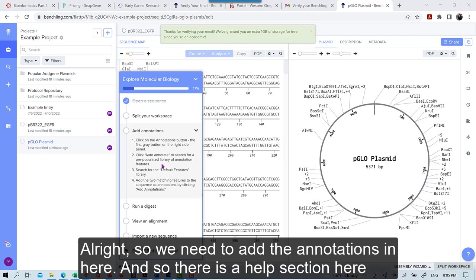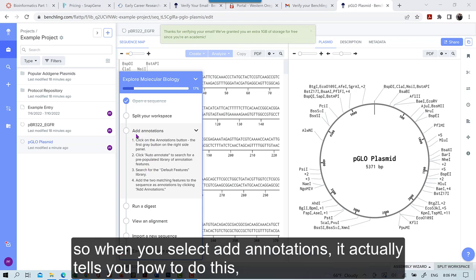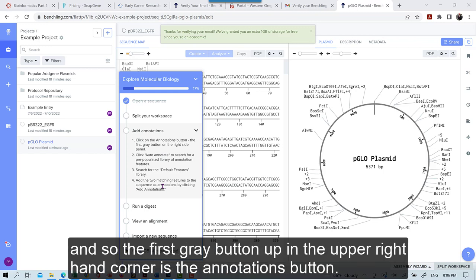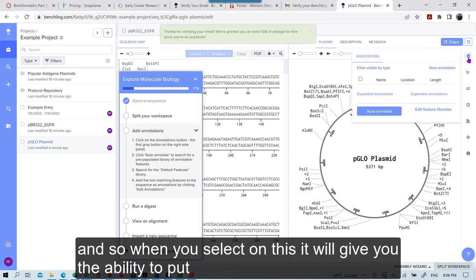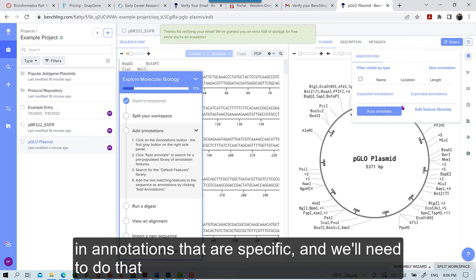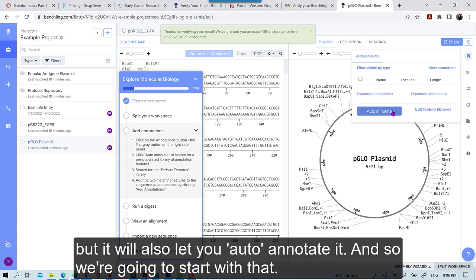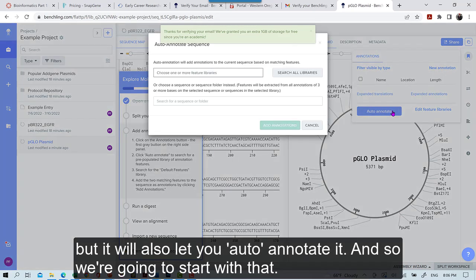And so there is a help section here. So when you select add annotations, it actually tells you how to do this. And so the first gray button up in the upper right hand corner is the annotations button. So when you select on this, it will give you the ability to put in annotations that are specific and will need to do that. But it will also let you auto annotate it. And so we're going to start with that.